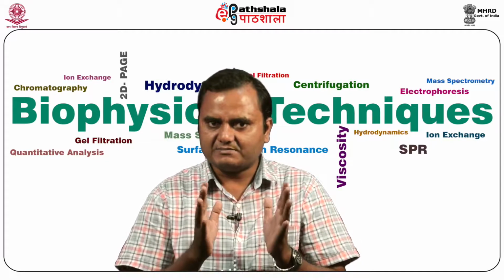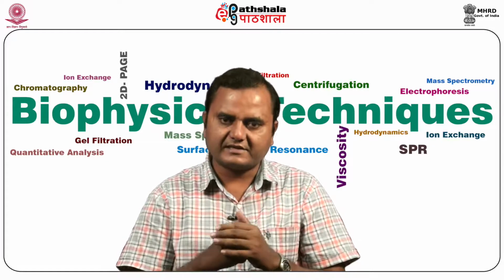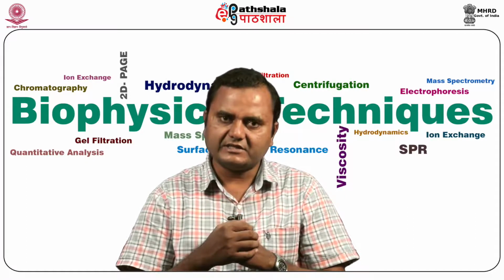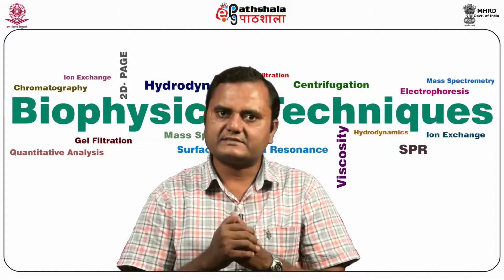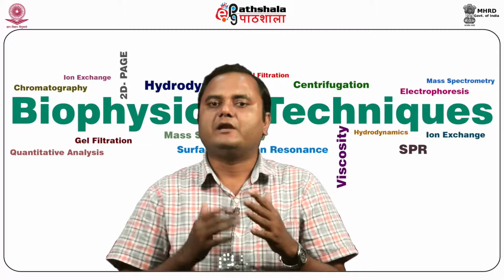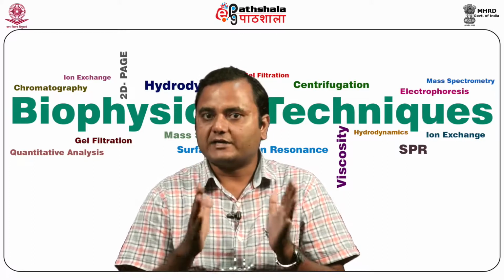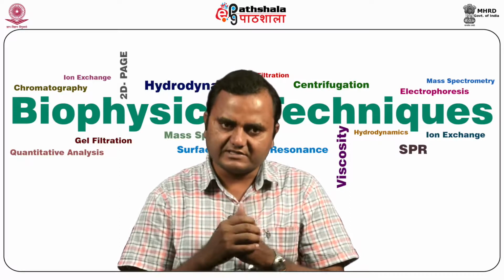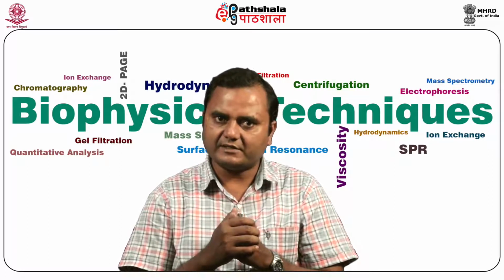But you must be sure that these factors are dependent on the temperature. So, the temperature should be taken into consideration, and at 20 degrees Celsius it is considered that the sedimentation coefficient value is 10 to the power minus 13 second, which is called 1 Svedberg unit, because this term was first given by Svedberg in 1940.